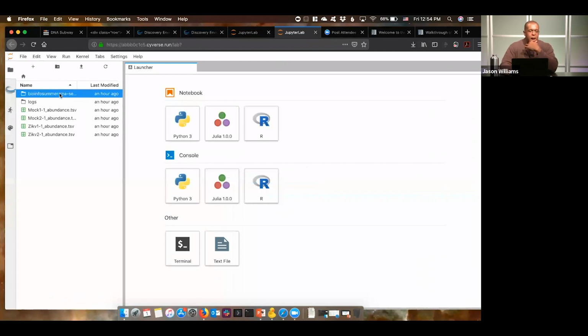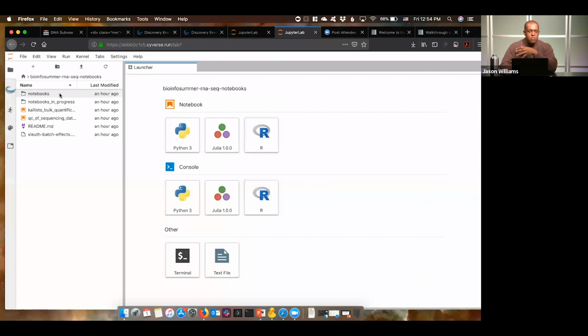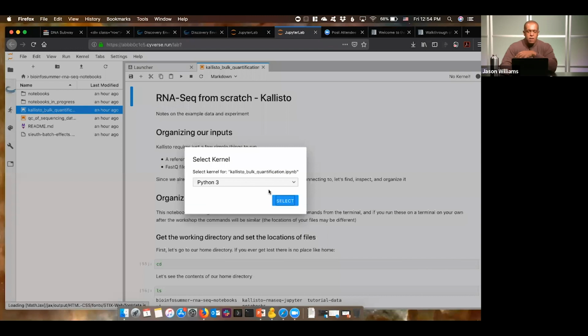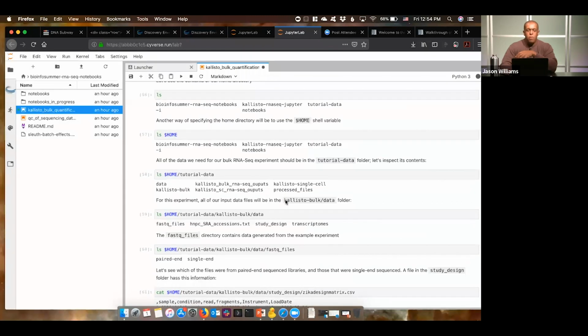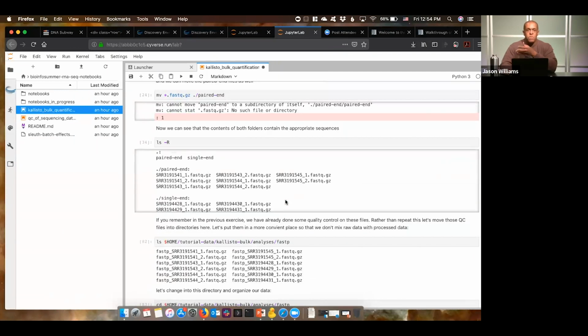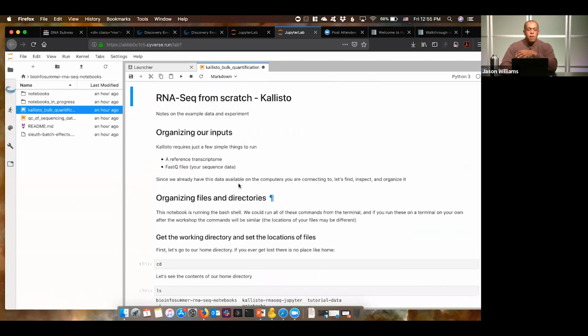I've loaded some notebooks that I use in teaching researchers how to do Kallisto RNA-Seq. If you're familiar with the idea of Jupyter, you can create Jupyter notebooks which go through your data sets. You can bring in your own data or data that you've partially pre-computed for Subway, so you can mix and match. You have the ability within CyVerse to launch things in Jupyter. There's a webinar that's been posted to YouTube, so take advantage of that.